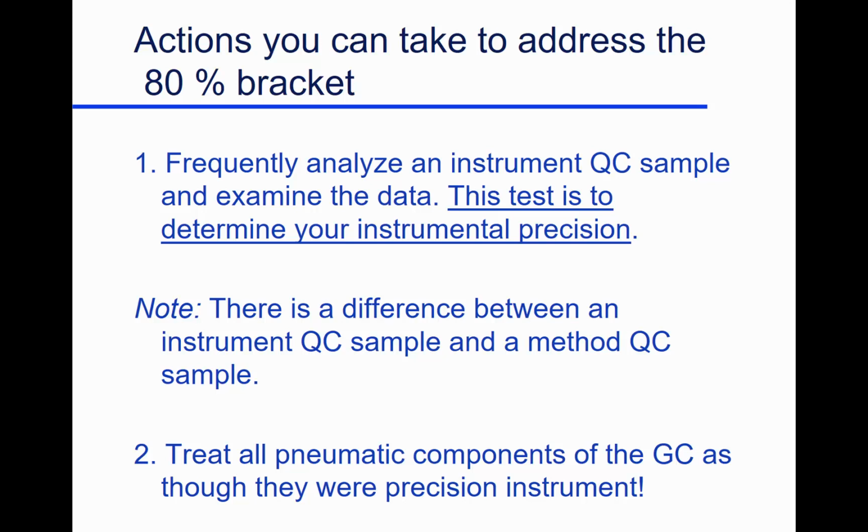What do you do? How do you know you're doing the best you can? How do you know your instrument is correct, giving you good data? Again, you run instrument quality control samples. And so you can inject known materials, known concentrations. You intersperse them with your samples and look and say, is your machine giving you the data that you expect? So, yep, you check that instrument.